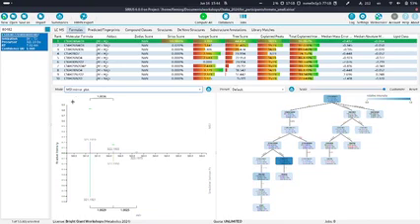Okay. And here we can now see at the top our measured MS1 spectrum with the isotope peaks, and at the bottom our simulated isotope pattern. For example, if we look at this, we can see the mass differences between the isotope peaks at the top and at the bottom. We can see the peaks and where the intensity should be and where it is.